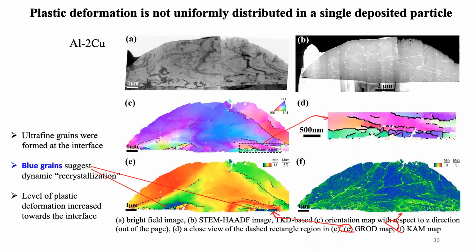One of the things that we noticed is that we actually had the formation of ultrafine grains right at that aluminum-steel interface. As we would predict, as we kind of saw in the SEM in the deposit, this is where these things come from. They come right at that impact site. They do have low values of intragranular misorientation. I think a lot of times we like to call that recrystallization. I'm going to use quotes on that, and we'll talk more about why in a few minutes.